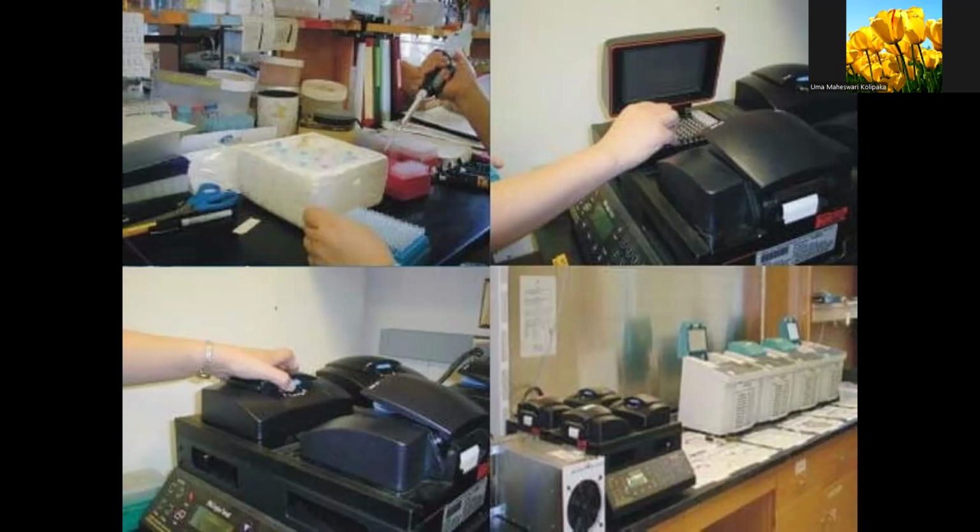We are changing the temperature from 92 to 50 to 70, 50 to 70 to 72, like that, so that our desired processes, that is denaturation, annealing, and extension, will take place.